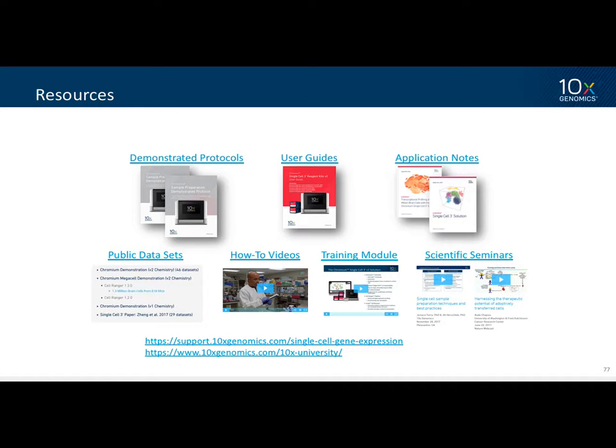If you want to do the single-cell RNA sequencing analysis or any type of single-cell analysis, you need to contact us way earlier than when your cells are ready. We cannot say, come here, tomorrow we'll have some cells ready. We cannot do that. The reason is that there are multiple labs. We have dozens of labs working with us, so we have scheduling as well.